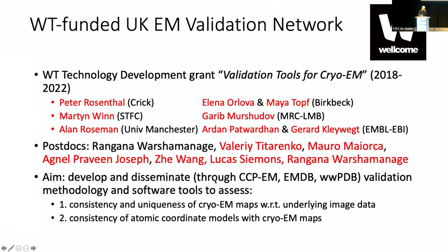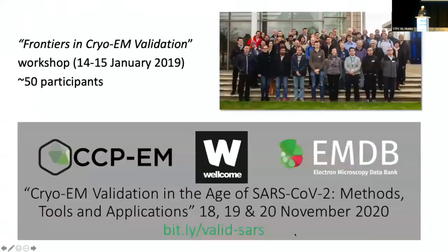Generally, as with the whole validation effort, the goal was to come up with tools for consistency and uniqueness of cryo-EM maps with respect to underlying data, and the consistency of atomic models with the cryo-EM maps.